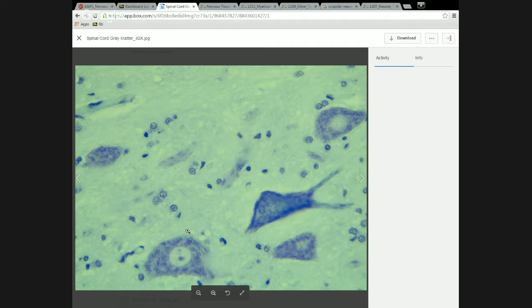Now, the cells that we're going to concentrate on looking at in nervous tissue are usually fairly large neurons. Okay? And these particular ones are the neurons that control muscle fibers. So this might be a neuron that controls the muscle that flexes my fingers. Okay? And so the neuron is located probably around the base of my neck. Okay?